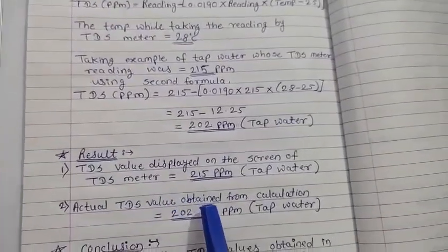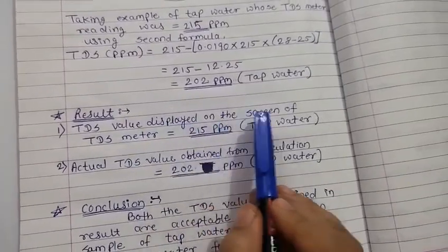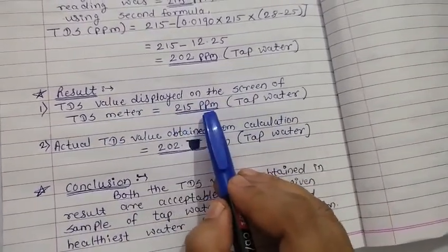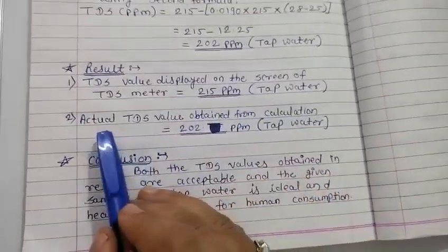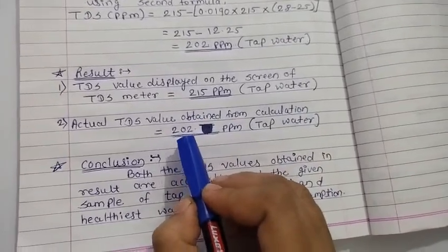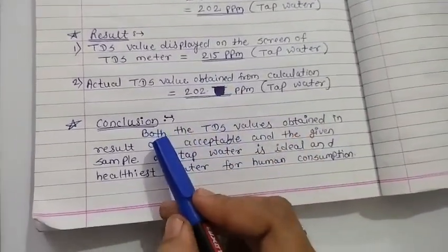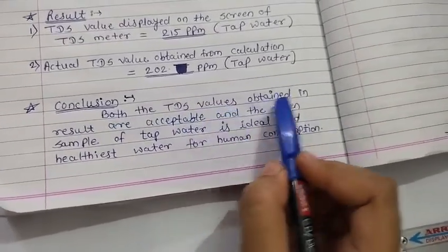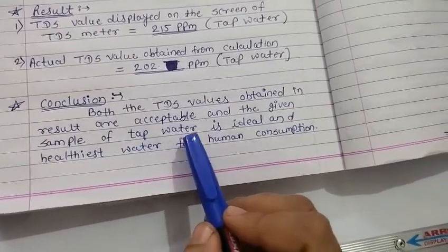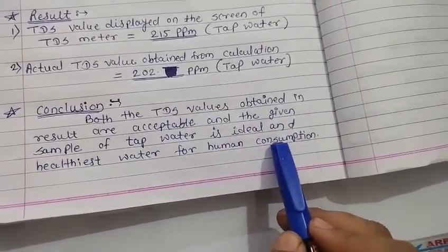By taking readings and calculation, we'll get the result. The TDS value displayed on the screen of the TDS meter for tap water was 215 ppm, and the actual TDS value obtained from calculation is 202 ppm. From the result, we come to the conclusion that both the TDS values obtained in the result are acceptable and the given sample of tap water is ideal and healthiest water for human consumption.